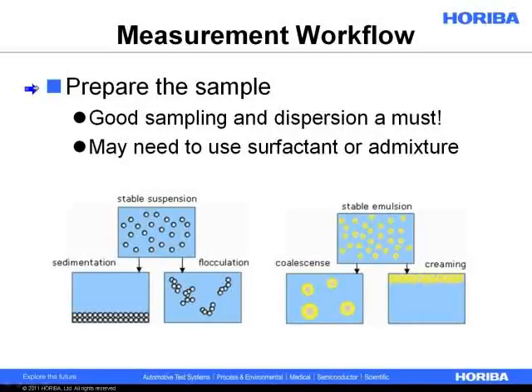whether it's arriving in your lab as a powder or a paste. A lot of times, many samples, many applications aren't ready for direct addition to the analyzer. It's sort of lucky if your application is so easy, because then you can just scoop it into the analyzer and save yourself a few minutes work, but a lot of times you have to do something to prepare it.